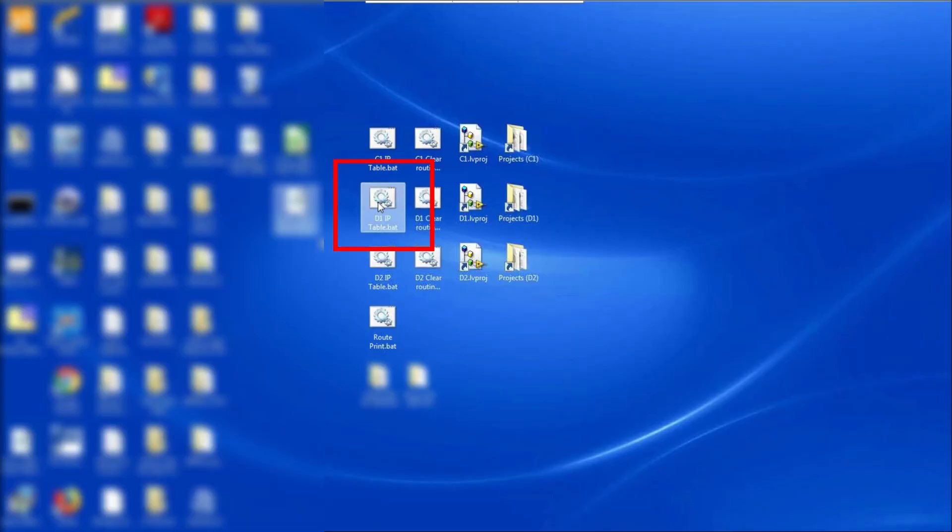In the desktop screen, right-click on D1IPtable.bat. This IP address extension is a Windows script that establishes a connection between the ABEC PLC and LabVIEW via an Ethernet connection.